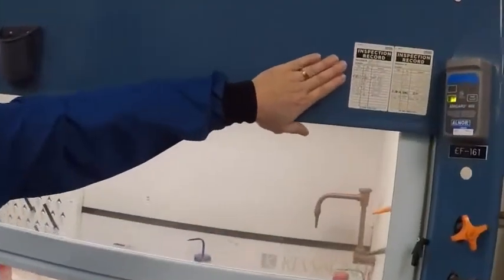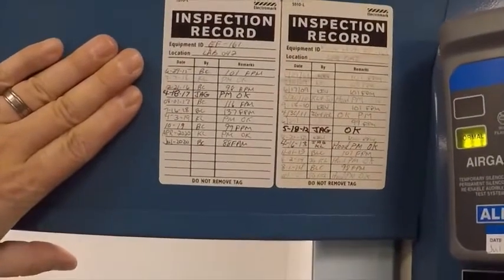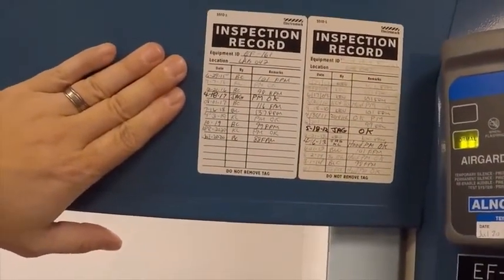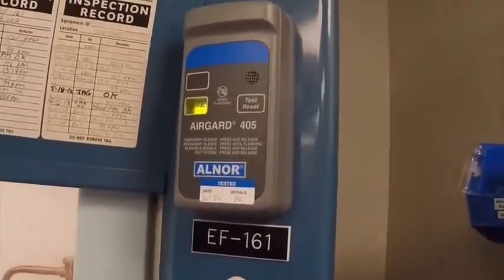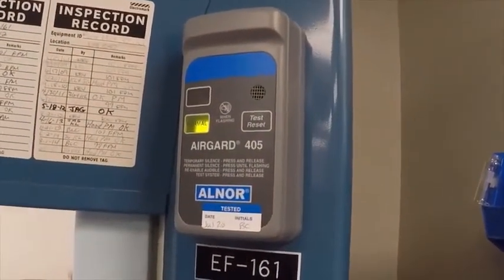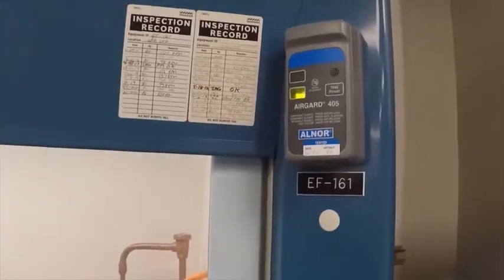All fume hoods need to be serviced and calibrated on a regular basis per OSHA. Every fume hood needs to have an inspection record on it, so if your laboratory area is inspected by OSHA, they can verify the hood has been properly calibrated and certified as working per OSHA regulations. The alarm is also calibrated and tested as part of that same inspection.